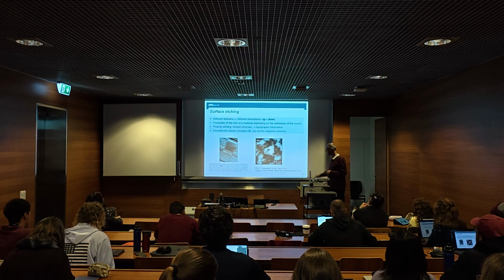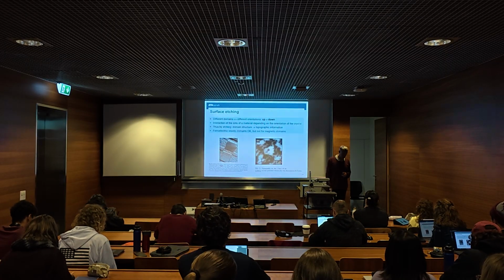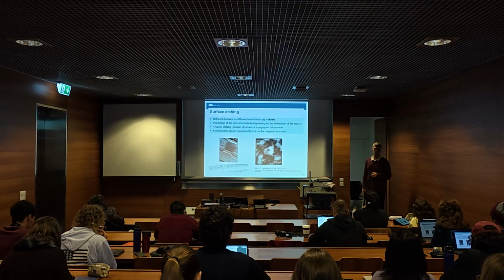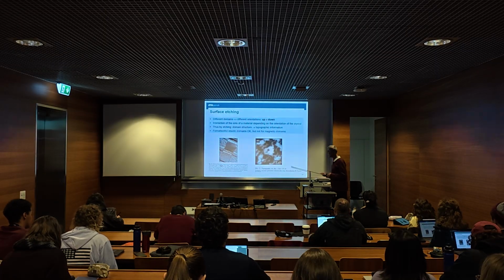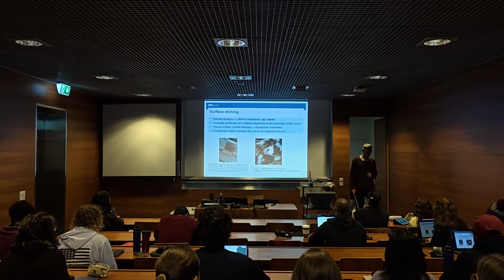Actually, this is something that we did a few years ago unintentionally when we polished our sample, and then we found that the polishing process is also etching material away, so we could see the domain structure just from little steps in the surface.